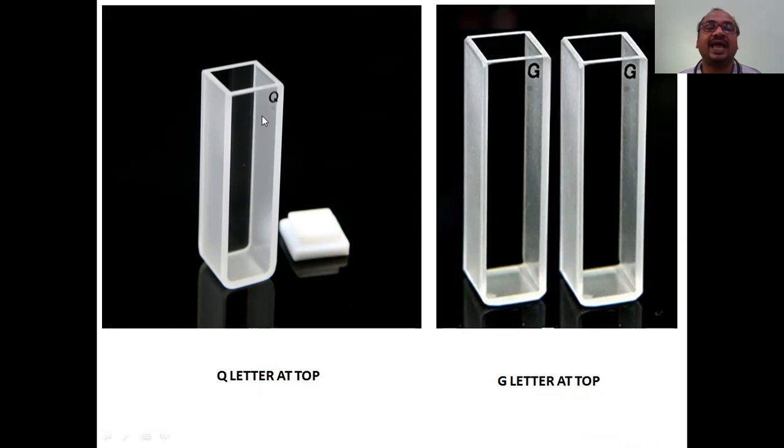The cuvette has four sides, just like a cubicle structure. Two opposite surfaces are rough - you have to touch only those rough sides while handling or cleaning. When you place it in the UV-visible spectrophotometer, the light should fall on the transparent side so that it passes through the sample, and the remaining light falls on the detector.